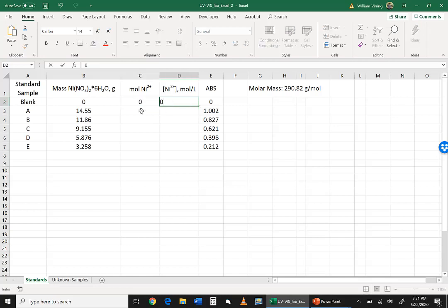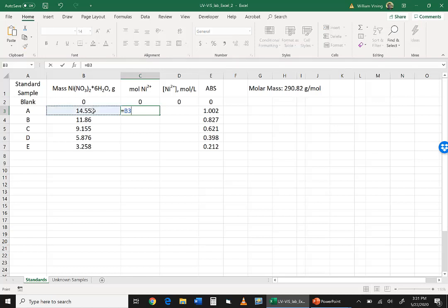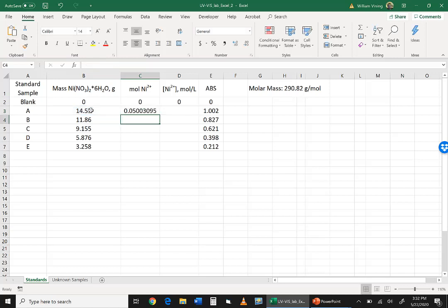So now what we're going to do here is we're going to calculate the moles of nickel present in our solution that we made containing 14.55 grams. So the moles are going to equal the number of grams divided by the molar mass. So I'm going to click on the cell for the number of grams and divide by the molar mass, which is 290.82, which we read off the bottle, but we could easily have calculated it. Okay, so that's around 0.05 moles.